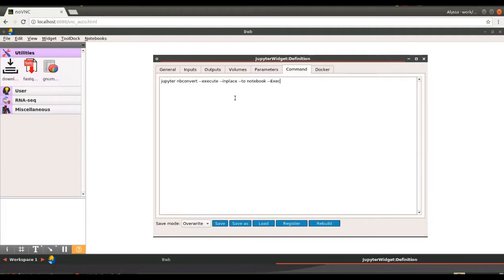Okay, here's where our timeout is going to come in. By default, if a cell takes longer than 30 seconds, nbconvert will halt it. Using this notation here, we can access our parameters. So we're going to use our timeout parameter. And then add our notebook file.